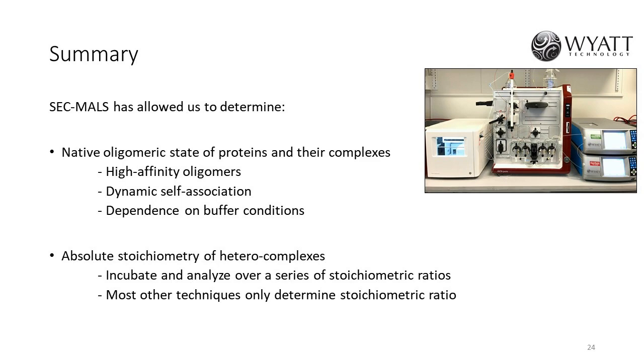All right, thanks. Here's the next question. Can we investigate the protein-DNA interaction in a similar way by SEC-MALS? Yes, we can actually. We can measure the 260 nanometer wavelength to measure DNA, and for the protein, we can use 280 nanometers as well as the refractive index. We can definitely do the same experiment and investigate protein-DNA interactions with SEC-MALS.